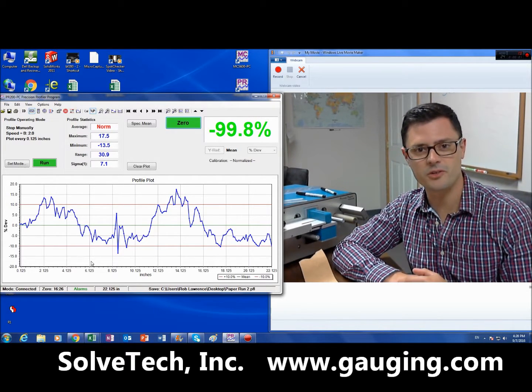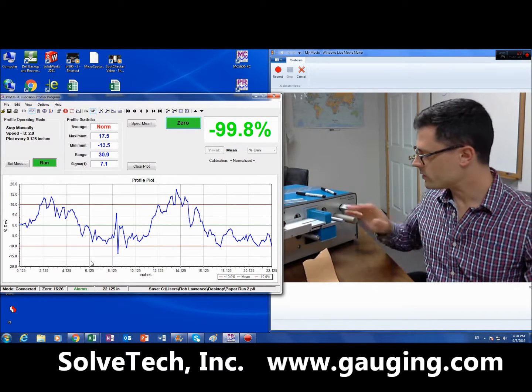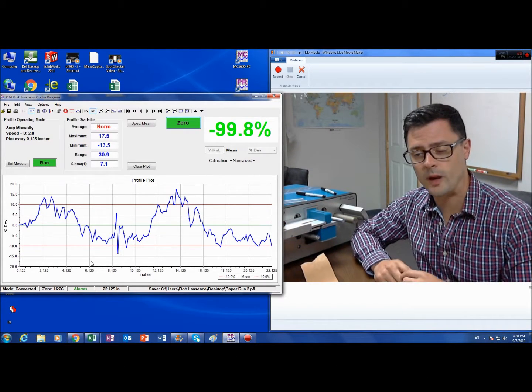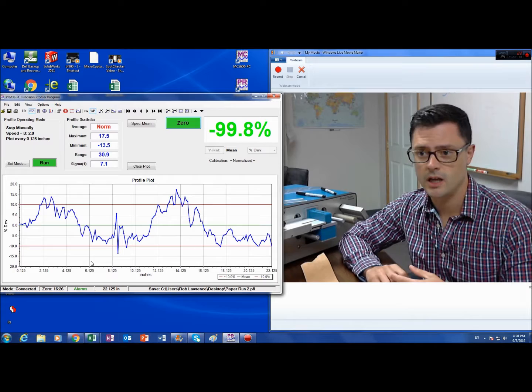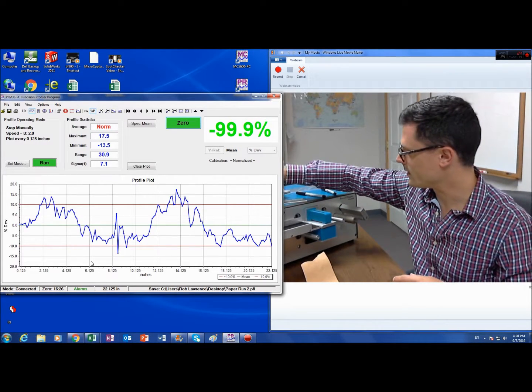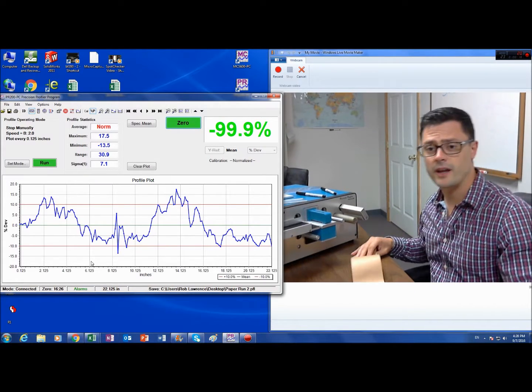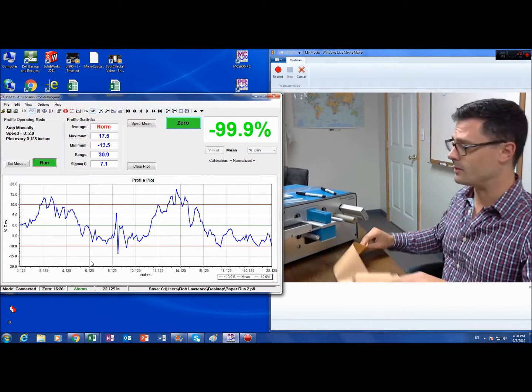Hi, this is Rob Lawrence, and I'm going to demonstrate the PR2000 running a strip of paper. This device can measure the uniformity of paper with extremely high precision, down to 0.1%. You've probably never seen anything quite like this. It's a non-contact gauge, and you don't have to calibrate it when you're running in percent mode.